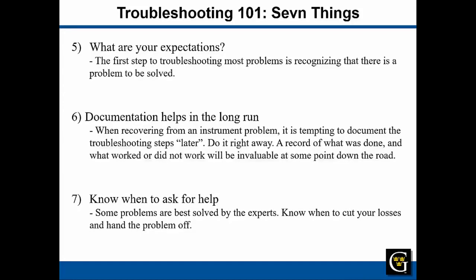Finally, know when to ask for help. Some problems are really best solved by the experts. As users, we don't know everything about the instrument. And if we feel like we've tried all the reasonable steps to troubleshooting a problem, then it's okay to call in an expert, a representative of the manufacturer or of some other service vendor, and hand the problem off to them.